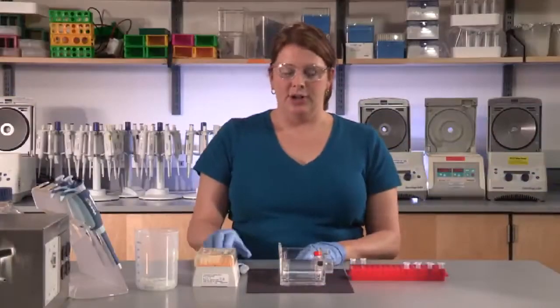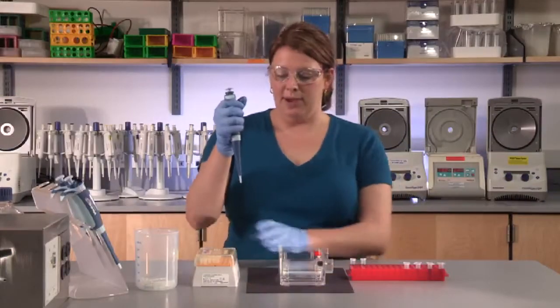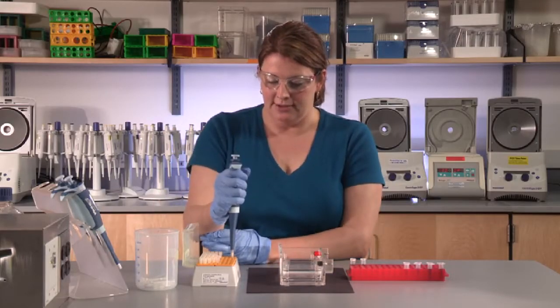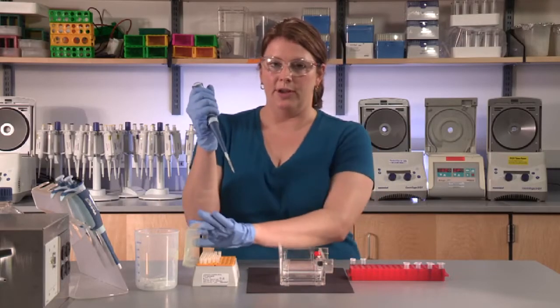When loading an agarose gel, you want to hold the pipette vertically, put the tip on, pressing down to be sure it's firmly on there.